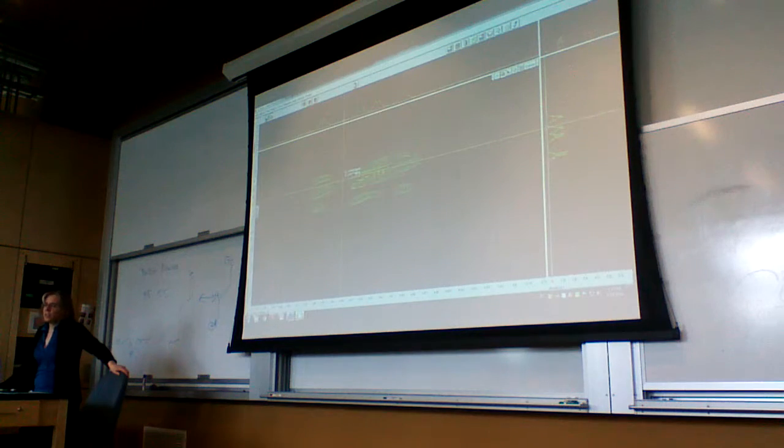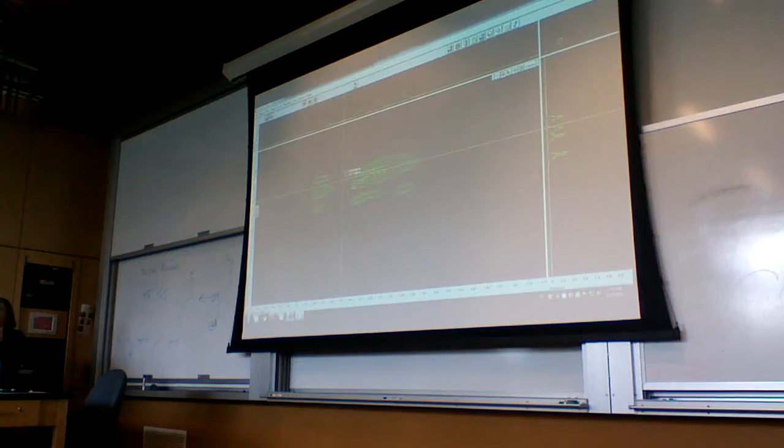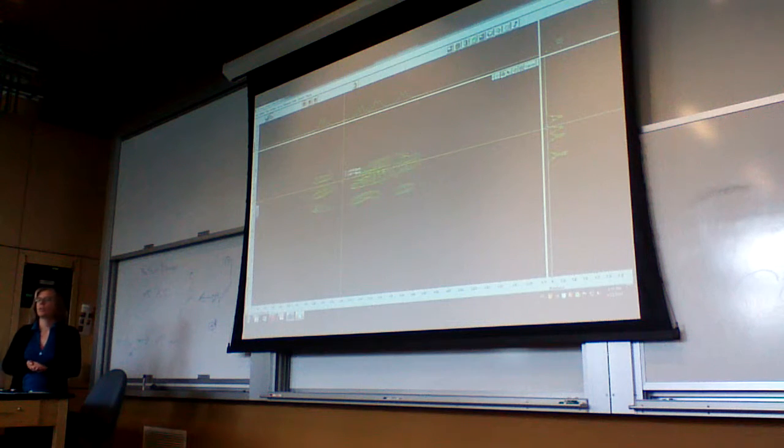Because we've labeled 2, 3, and 4 bond couplings, right? Did we get to 4 bond couplings? I think, oh yeah, with the long range. With an alkene, you are going to see that kind of long range coupling. With a normal alkane chain, you may not see that kind of long range coupling. But it helps us to identify all the coupling.